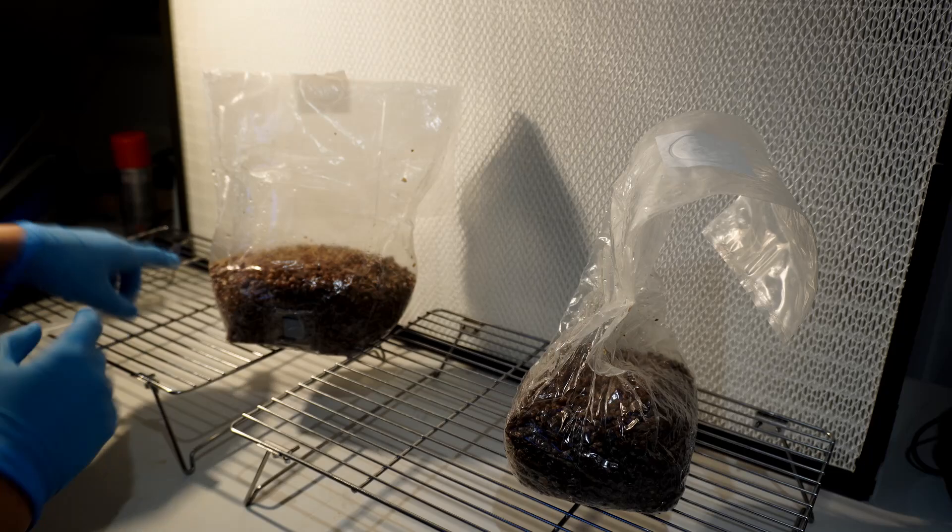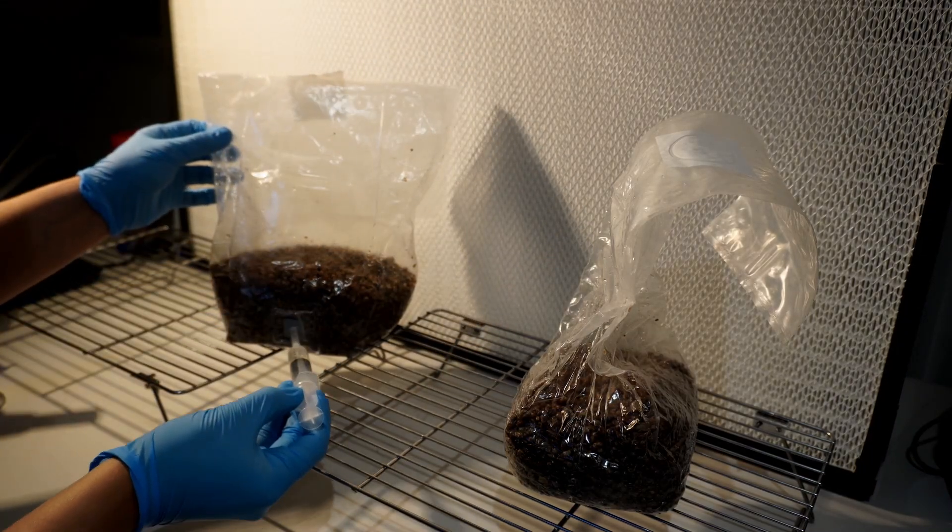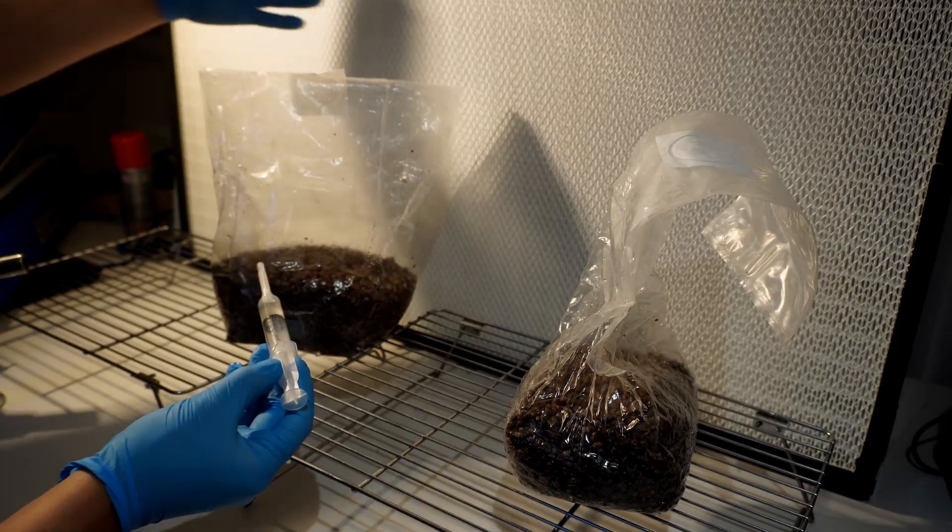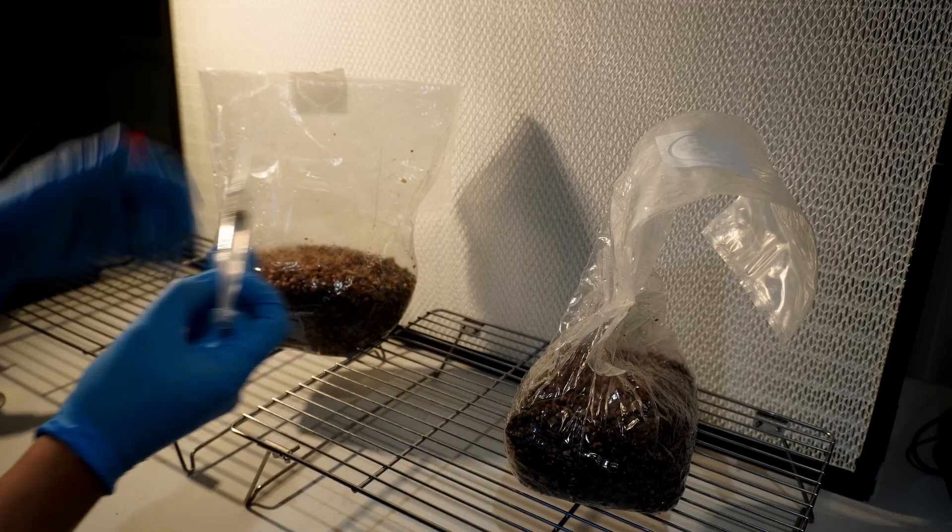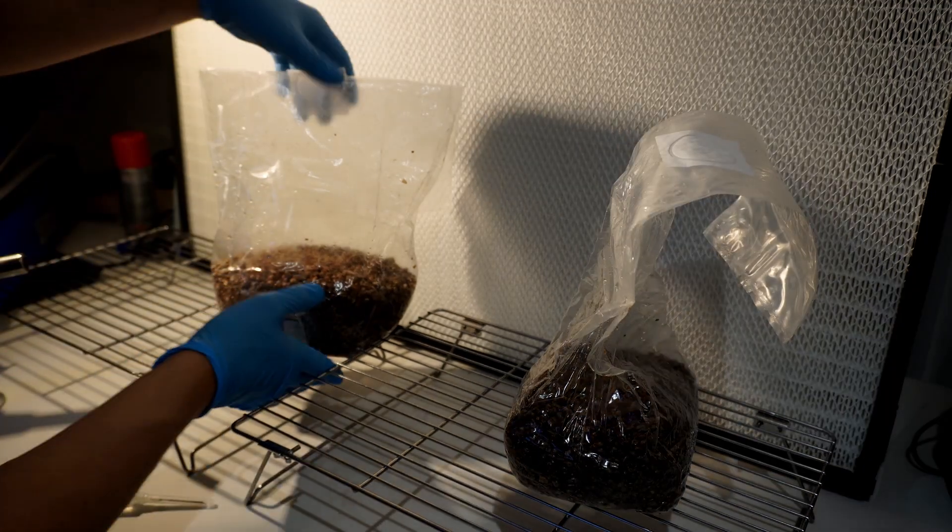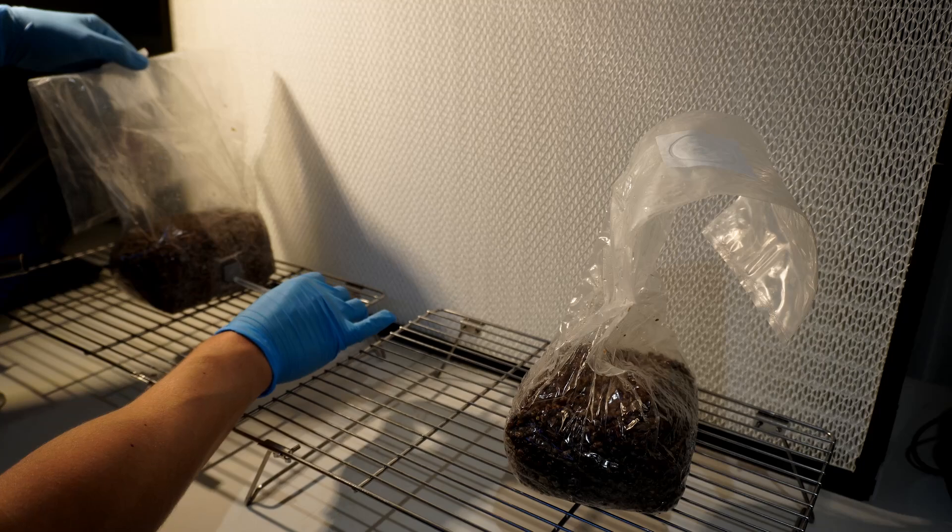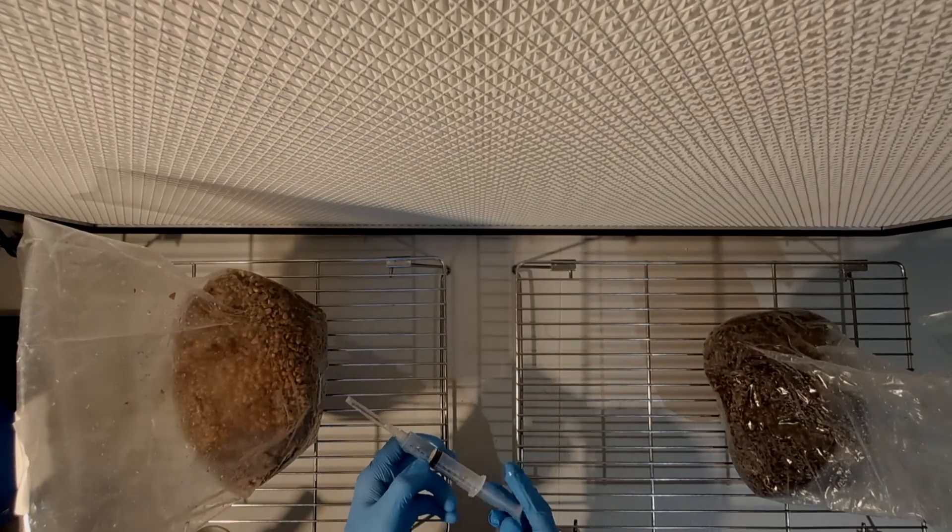When you come to inoculate your grain spawn don't allow the grain spawn bag to block the airflow. If you're injecting coming in from this side then you're essentially blocking off the airflow with your bag. So what you want to do is either turn it to the side or turn it facing up and I'll show you again when I actually go and do the inoculation.